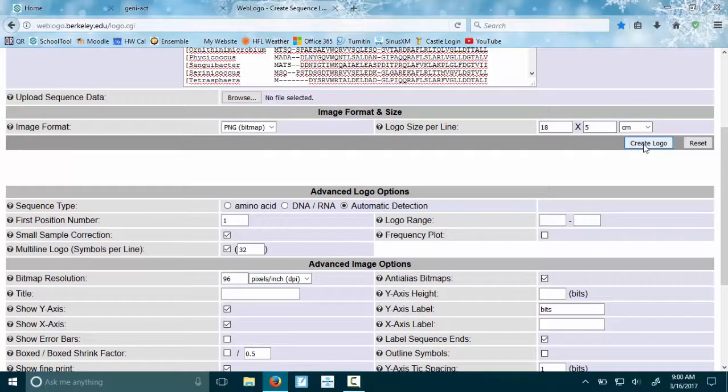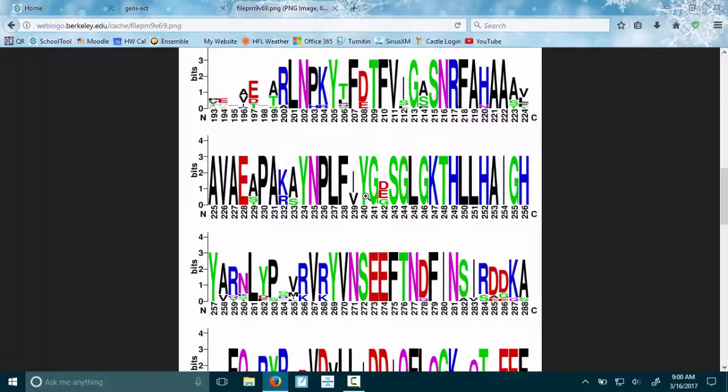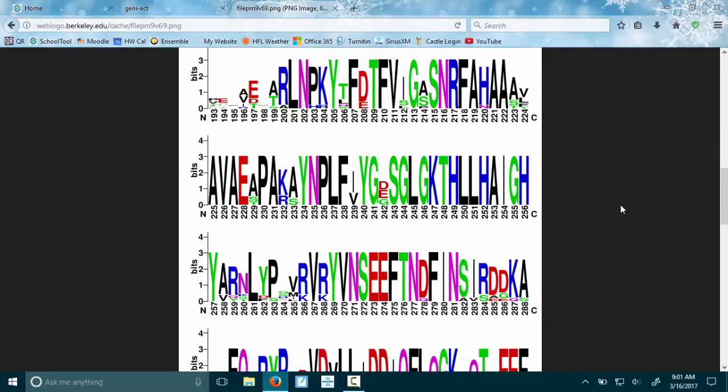You'll see it pops up this really colorful thing that's hard to read, but if you hover over it, it should let you zoom and it becomes a lot easier to read. We're going to upload this image to our notebook in a second.